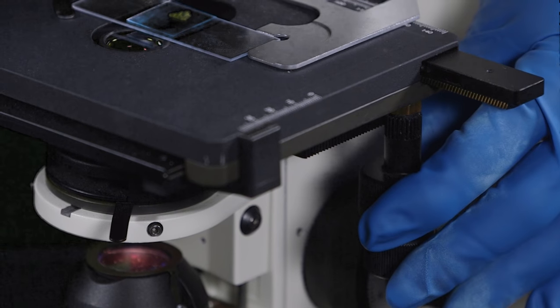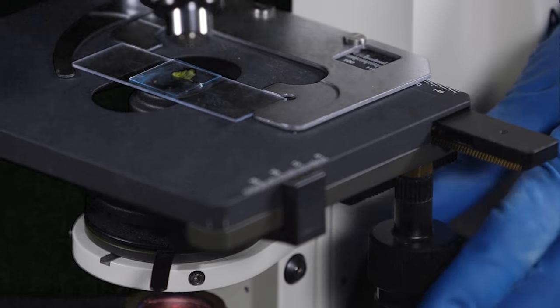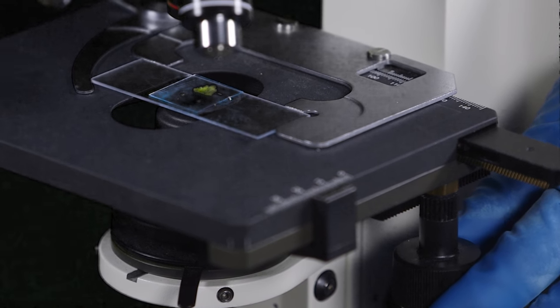Use the stage adjustment knobs to move your specimen over the condenser so that it's in the light and centered.